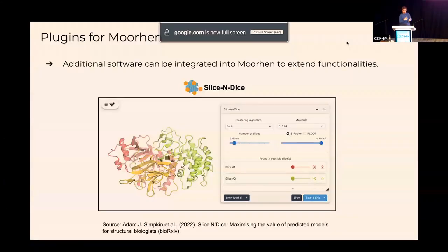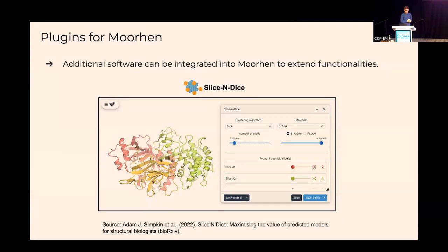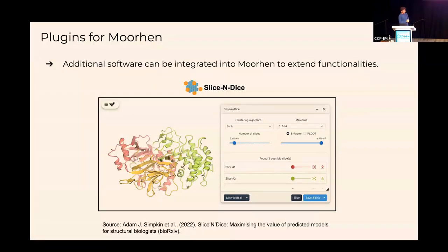Right. So you've seen basically a taster of what you can do in Moorhen. There are obviously more and more features that we're adding, and we're working hard to add more. We're also collaborating with different groups to generate different plugins for Moorhen. This is, for example, a very recent plugin that we have added into Moorhen.